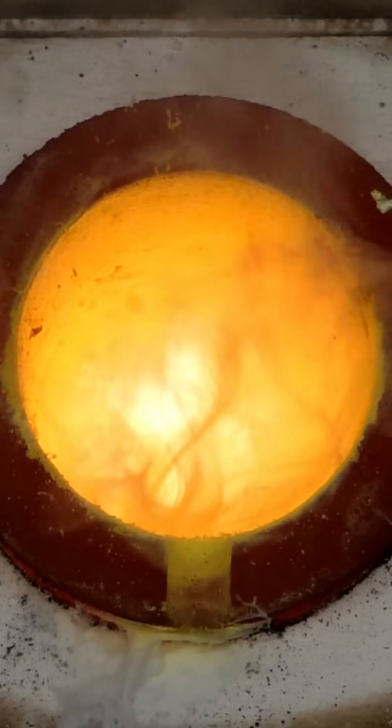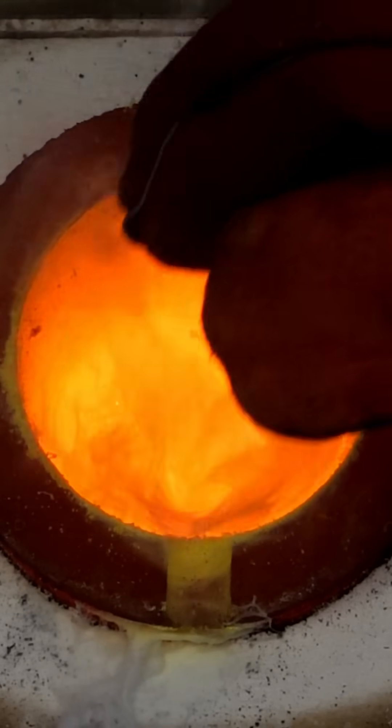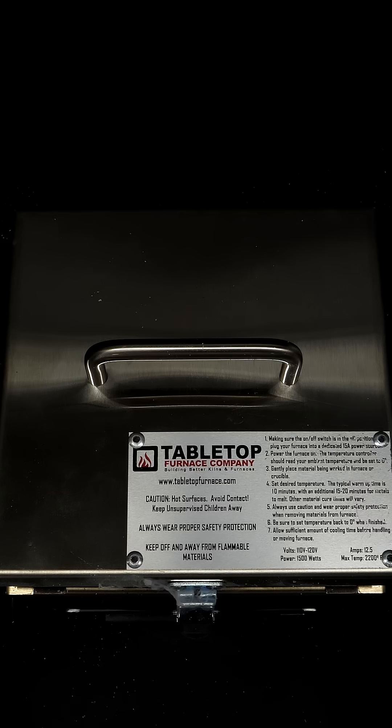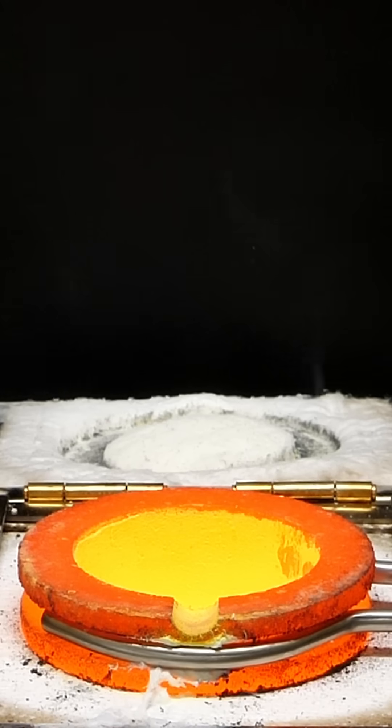Now it's time to add the last ingredient, which is just a small amount of tin metal. This isn't nearly as reactive as the zinc, and I'll close the lid and let it cook for a bit. After a couple minutes it should be good to go, and it's time to pour it out.